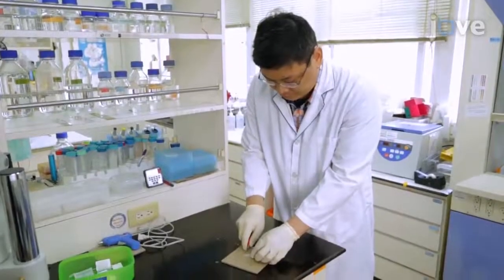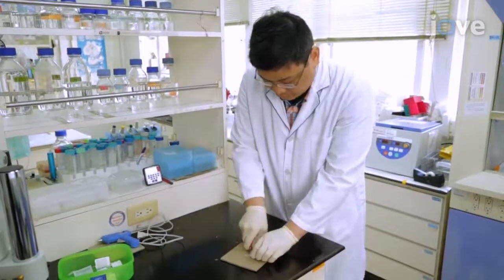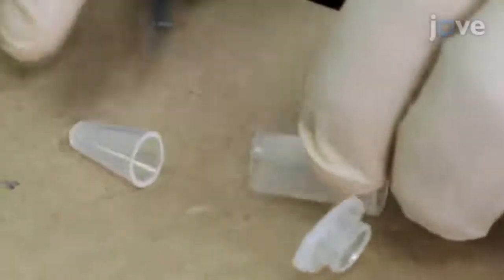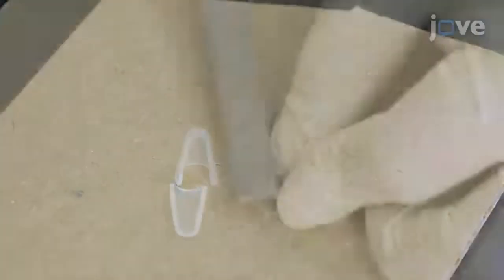To begin, make a holder to use neonatal pups in a stereotaxic apparatus. First, make the head tray. Cut off about one-fifth of the bottom of a 1.5 milliliter centrifuge tube to make an opening for the head of a neonatal pup.